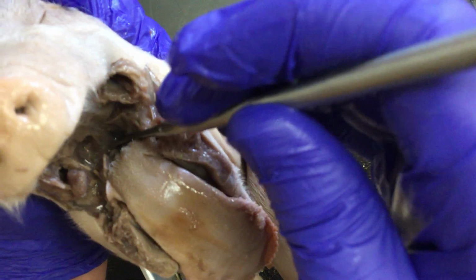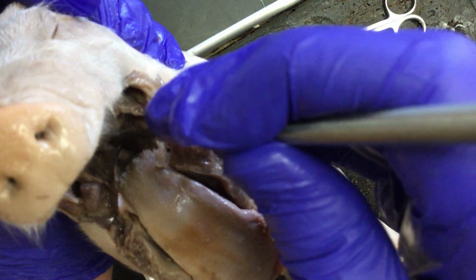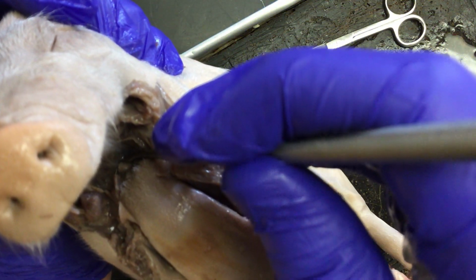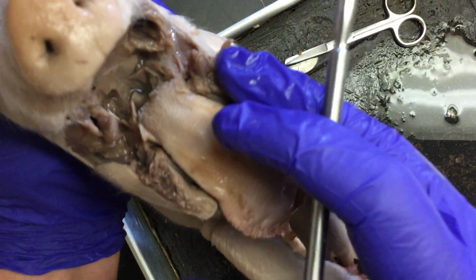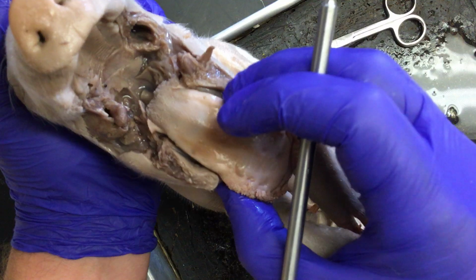This epiglottis will cover the opening to the trachea so that when this pig is swallowing, food does not go down into its lungs. Food goes into its esophagus. We have an epiglottis just like this pig has an epiglottis.